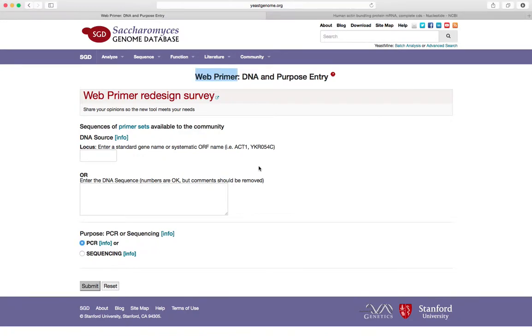This is a tutorial for primer design using a free online website. Here we will be using WebPrimer. The first step is to get the sequence from GenBank.